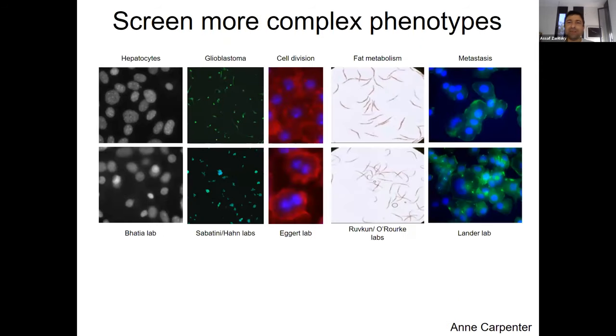So here are examples. You can look at these images and see that, for example, the worms here and the worms here are different. So you have an effect here, and you can annotate whether they are affected or not affected. If you know in advance what you want to measure exactly, it's fine and you can measure that specifically. But if you are not sure what the discriminative measures would be, then just use the annotation and train a model to discriminate.